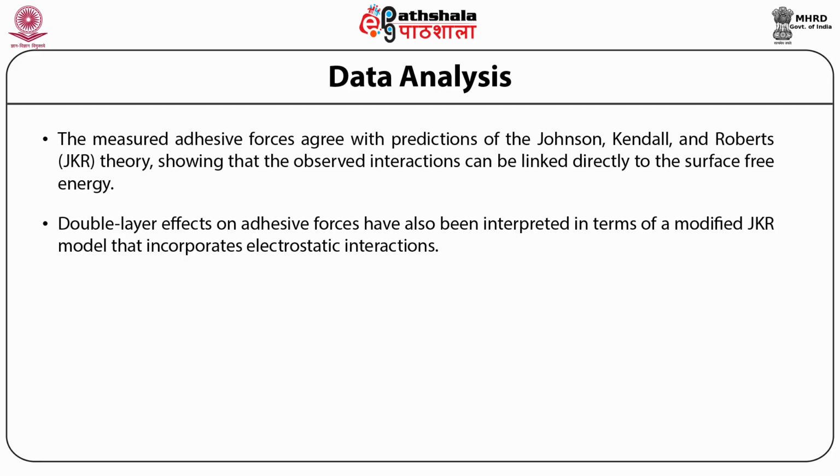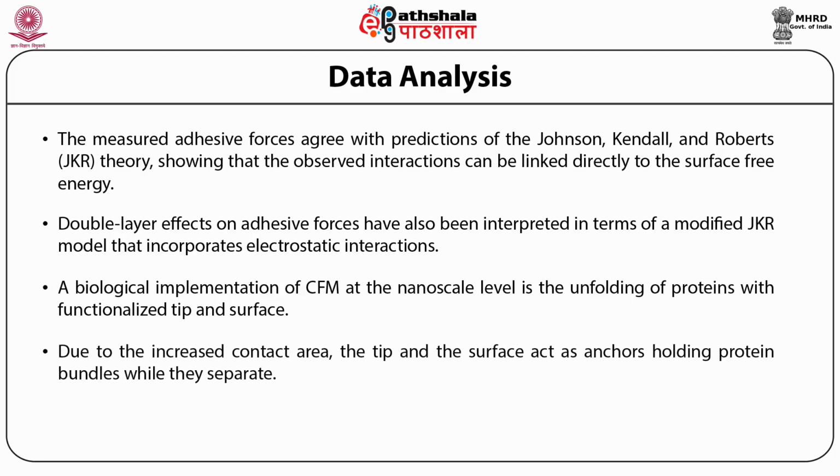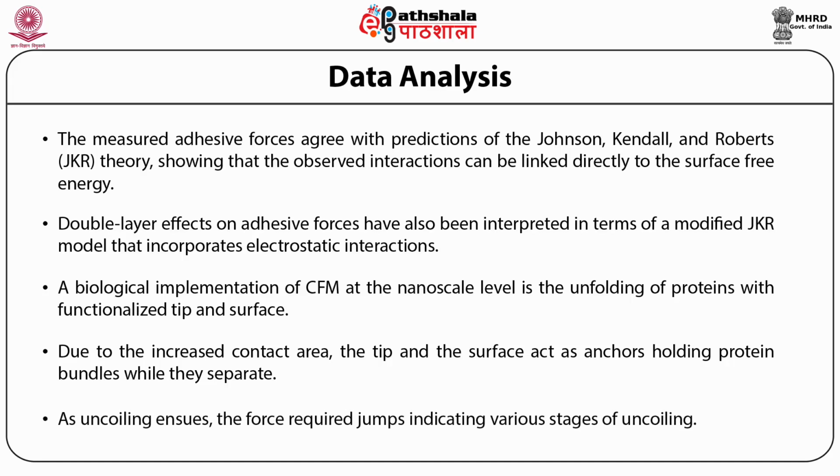A biological implementation of CFM at the nanoscale level is the unfolding of proteins with functionalized tip and surfaces. Due to the increased contact area, the tip and the surface act as anchors holding protein bundles while they separate. As uncoiling ensues, the force required jumps, indicating various stages of uncoiling.